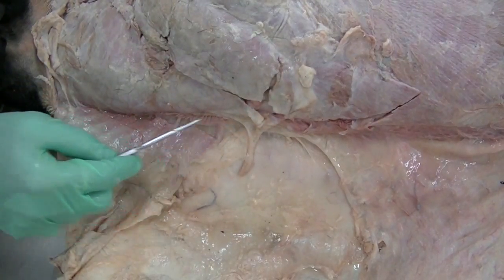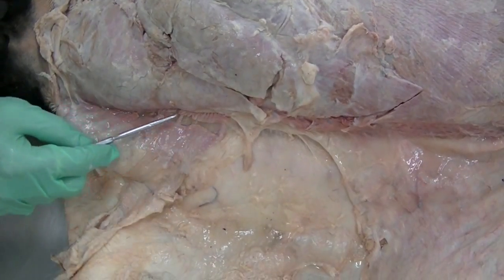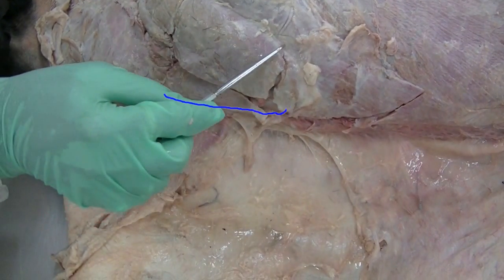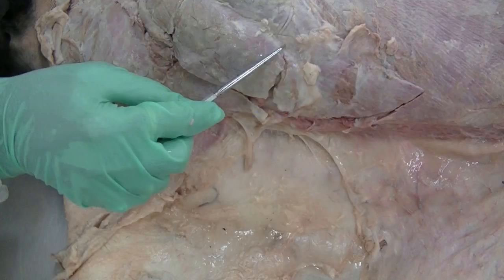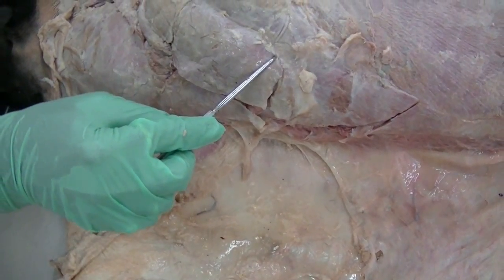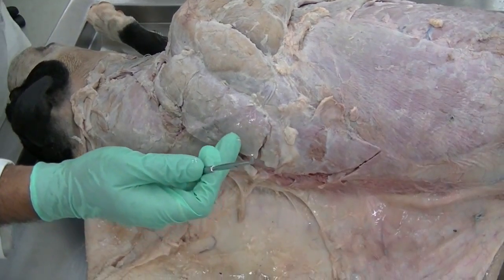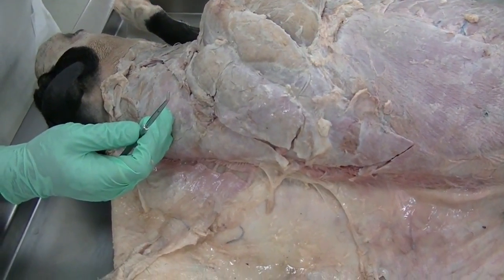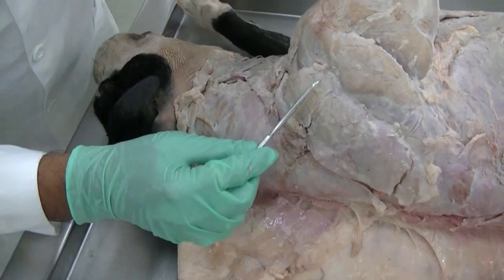and the part which goes further towards the dorsal midline of the neck is the cervical portion of the trapezius. Both of them attach to the spine of the scapula. As we come further cranially towards the neck, we see another muscle, or at least part of that.